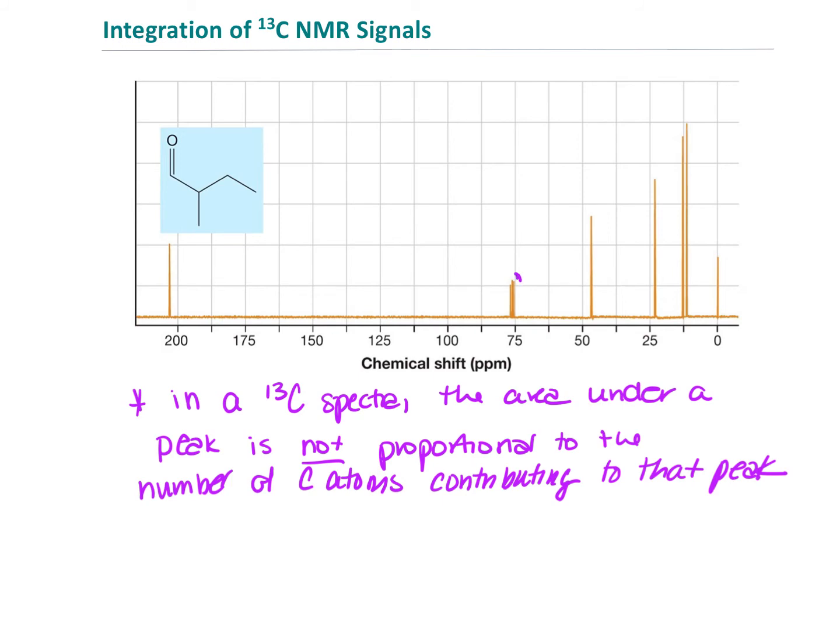Now, if we were going through and analyzing this, I want to point out a few different things. So when I said there were 5 peaks, right, this is due to the solvent. That's not one of the peaks, right, which is CDCl3. This is due to TMS, right, tetramethylsilane. And so our peaks then fall as 1, 2, 3, 4, and 5. And so when we look at this, we can go ahead and say, hey, look, that's going to be our carbonyl peak there, right? And then our next peak is going to be the carbon next to the carbonyl, which is going to be there, right?